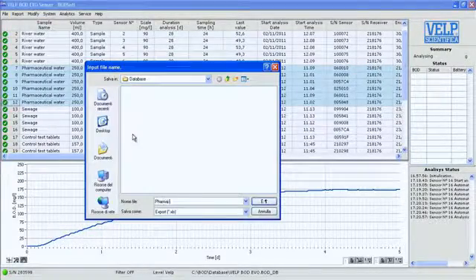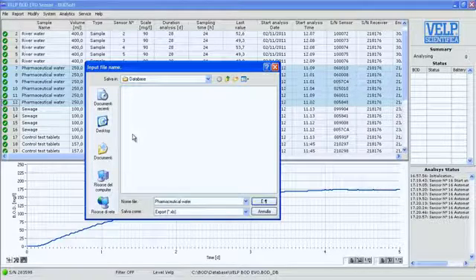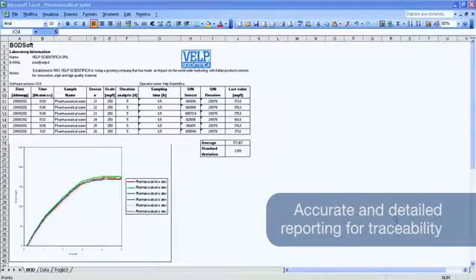They can be easily monitored, compared and exported in XLS, TXT and CSV format to PC for data traceability.